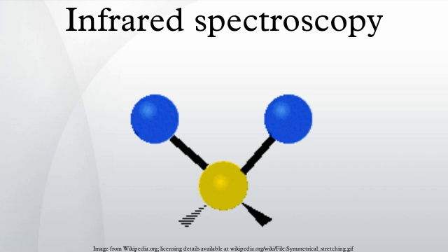There is an alternate method for taking spectra, where one wavelength at a time passes through the sample. The dispersive method is more common in UV-vis spectroscopy, but is less practical in the infrared than the FTIR method. One reason that FTIR is favored is called Fellgett's advantage, or the multiplex advantage.